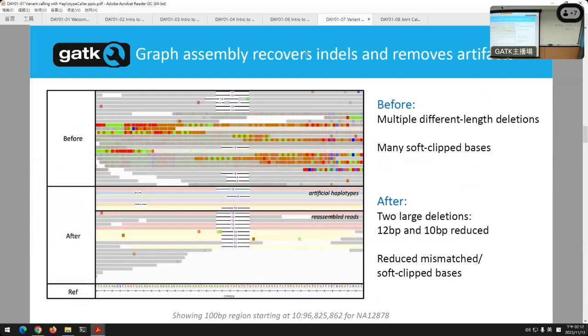All right, so this is an example of why we don't trust BWA. BWA, again, was good, but this is why we don't. Let's look on the bottom and explain why. Look at the reference sequence. If you look carefully, you see AG, AG, AG, AG, TG, TG, TG, over and over again. This is exactly the case that the sequencers do terribly on. Once it sees too many A's and G's or T's and G's, it starts to hallucinate and imagine the wrong bases. I don't know why, the chemistry starts to bleed and there are issues.